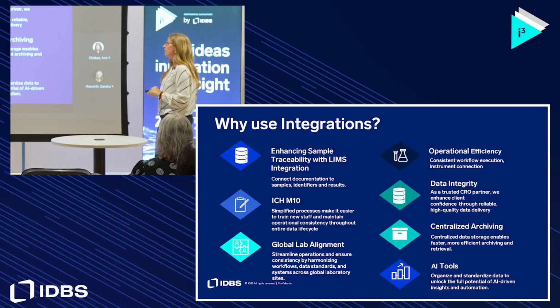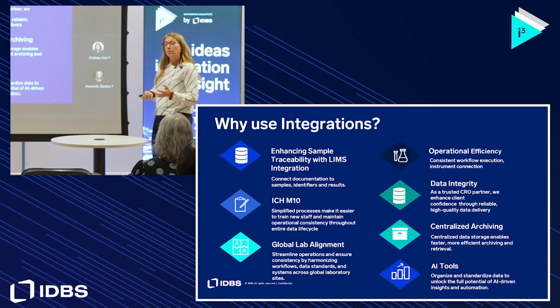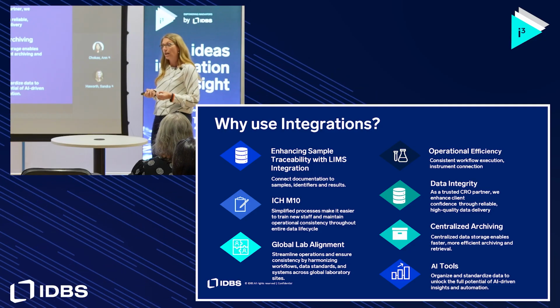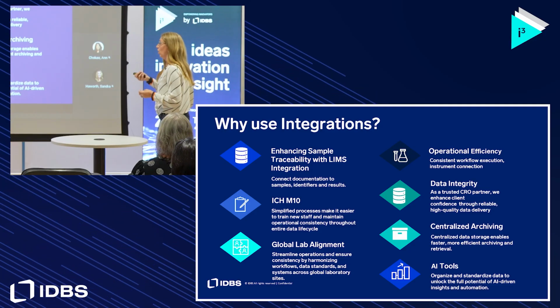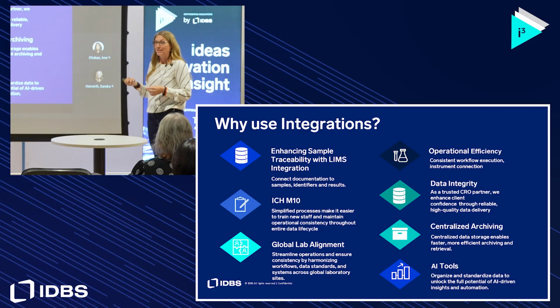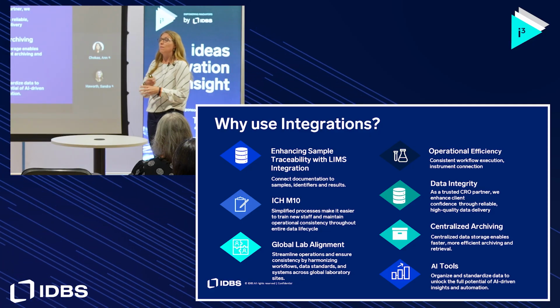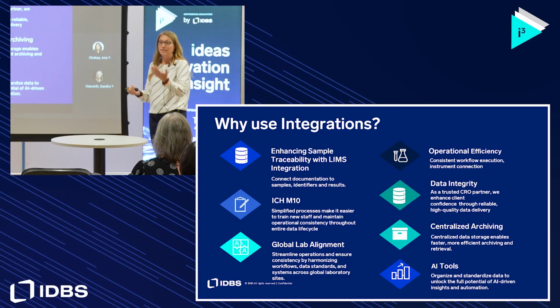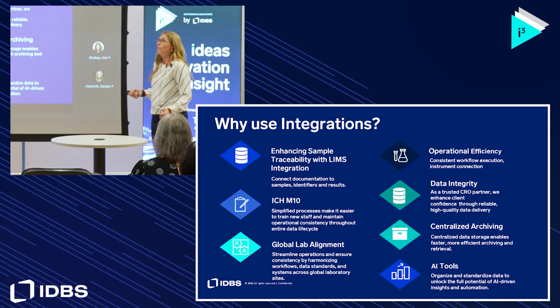Another reason why we're using integrations is to align with the ICH M10 guidance. Definitely from the data reporting side, there are some standards that we're following. So if we can design a template to report the data exactly in the format we're supposed to, it makes it so much easier for our medical writing team to just take the data straight from ELN and put it in the final report.